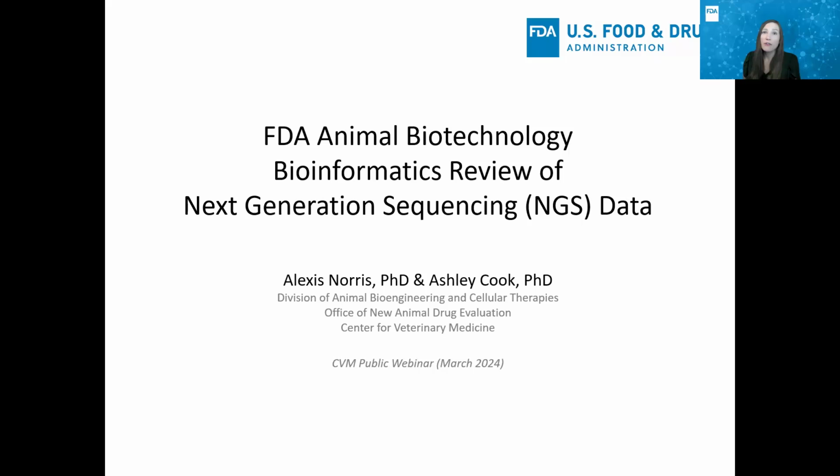There's an increasing number of developers using next-generation sequencing as a tool for product characterization for IGAs in animals, notably for the confirmation of the IGA and identification of any unintended alterations. Next-generation sequencing allows for screening the genome in a single assay, providing valuable information for FDA's review of the IGA.